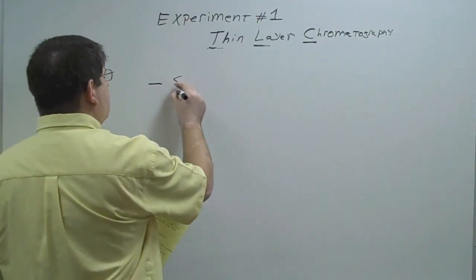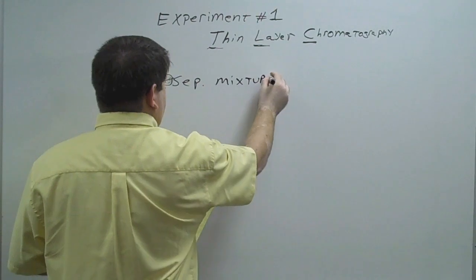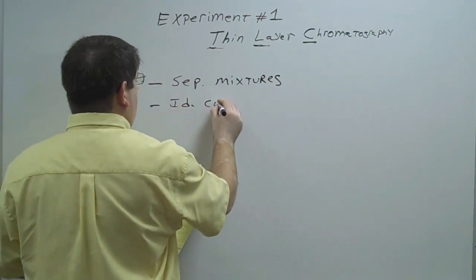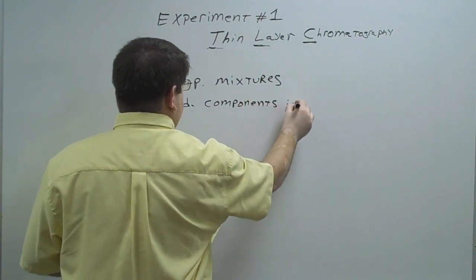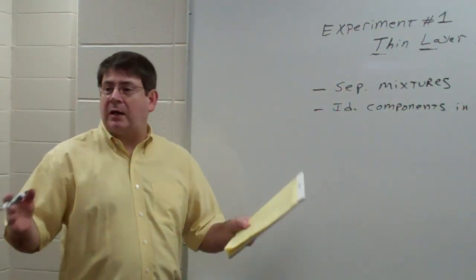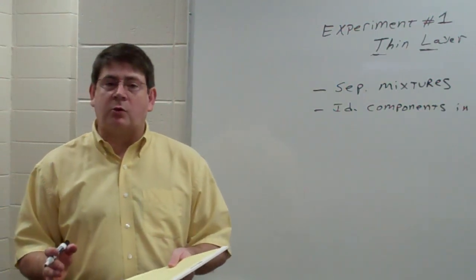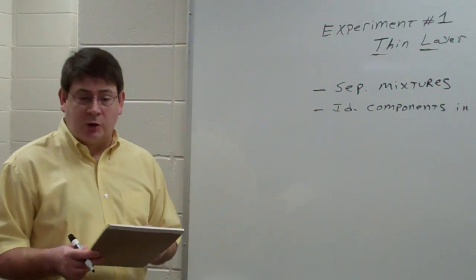Not only does it allow us to separate mixtures, it also allows us to identify the components of a mixture. So not only can we take a complex mixture and separate it into its components, with thin layer chromatography we can actually identify what those components are by some values that I'm going to show you how to calculate here in just a moment.